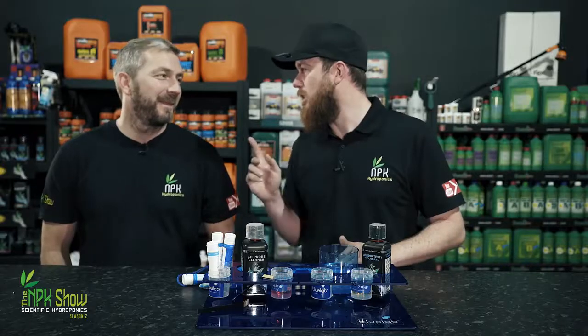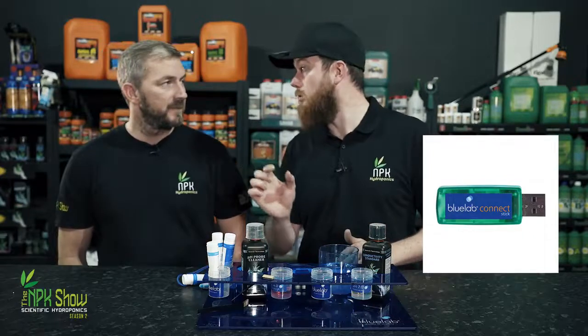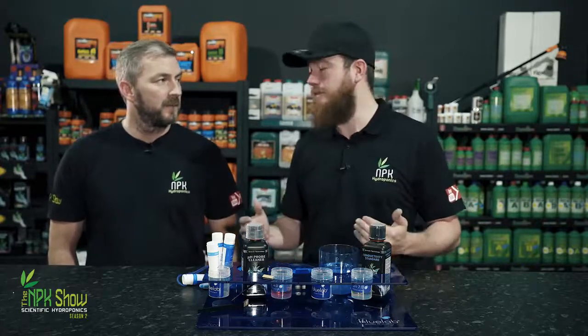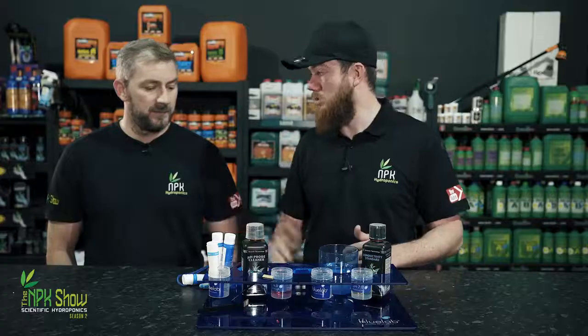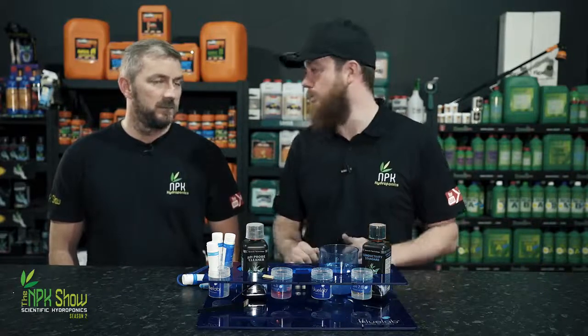Anyway, what's another piece of kit that I'm forgetting? The Bluelab Connect. What this does, you've got a USB dongle, and you can be anywhere in the world, and you can see what your pH or your EC or your water temperatures are. Obviously, they're a bit more expensive, but they're great for greenhouses, great for scientific labs. Scientifical? There's another word I've just made up. Scientists making words up again. We always do. We sell a lot to scientific labs all across the world, and they absolutely love them. They really like the high quality pieces of kit. So if they can be impressed, I'm sure you'll be impressed.